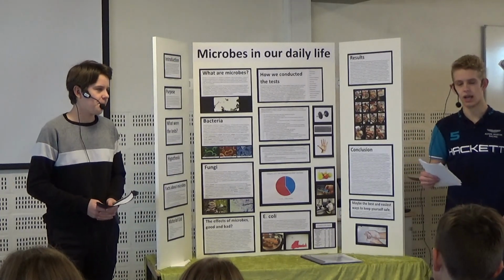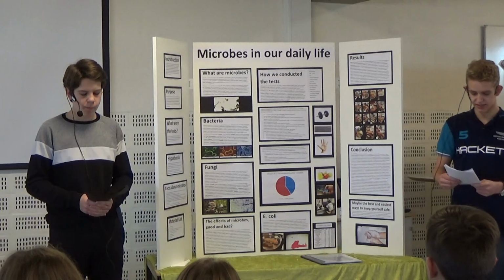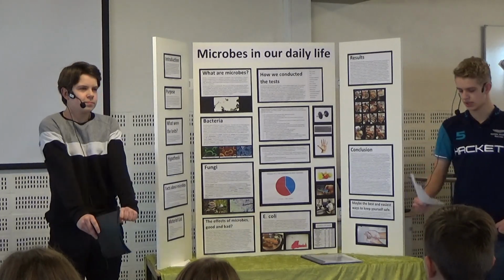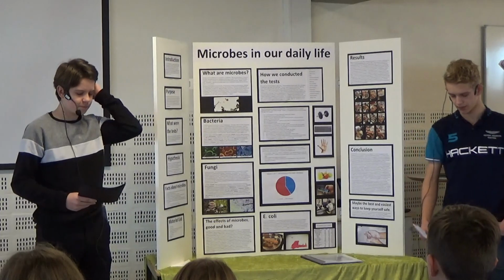To do that, we had to make agar plates, take samples of the places we wanted to test, make slides, and then identify the microbes. We hope to learn more about microbes, what they are and where they can be found and how dangerous they are, and then a little about the consequences of not being hygienic.